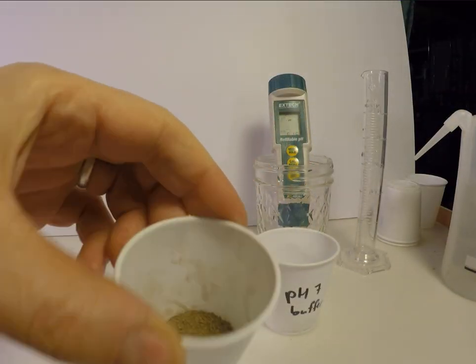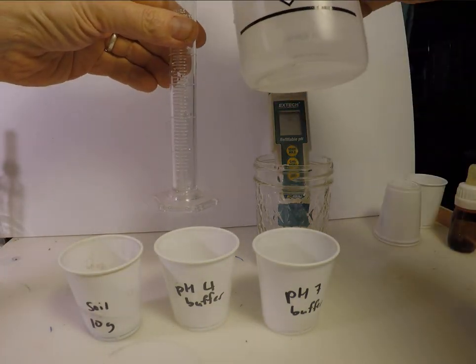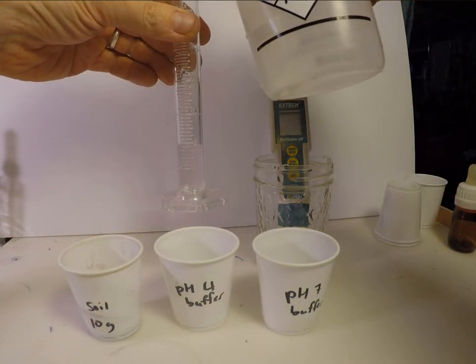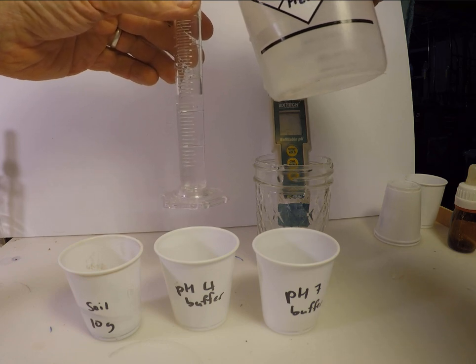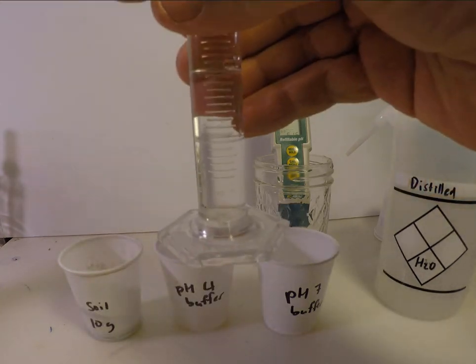Then, a 2 to 1 volume to weight suspension of soil in water is made. In this case, we are mixing 20 milliliters of water with 10 grams of soil. We could also use 40 milliliters of water and 20 grams soil.